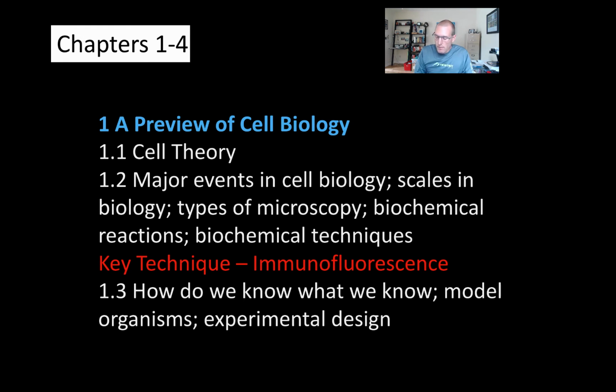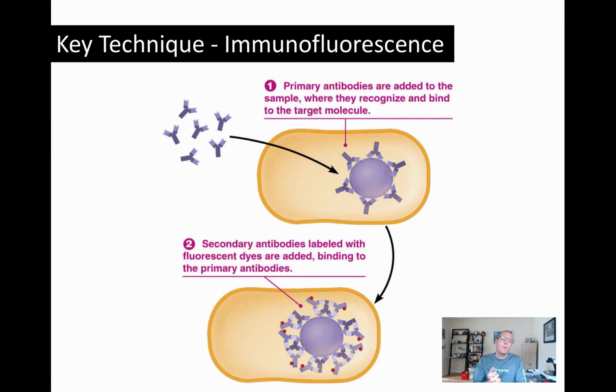So immunofluorescence, there are a couple of different ways you can do this technique. This is a visualization technique that's used in combination usually with confocal microscopy. Remember, that's the microscopy where we have a labeled cell, and here we're going to label the cell using immunofluorescence, and we take thin slices, optical slices, by focusing on one plane in the sample and then slightly adjusting the microscope and taking another image in another different optical plane. Then you can stack those all together and you get a very high quality stacked image.